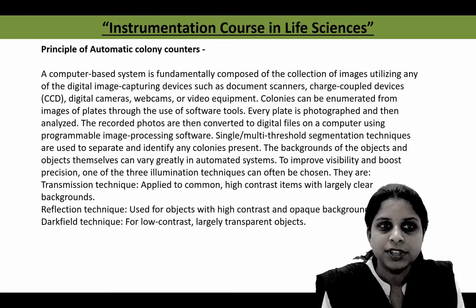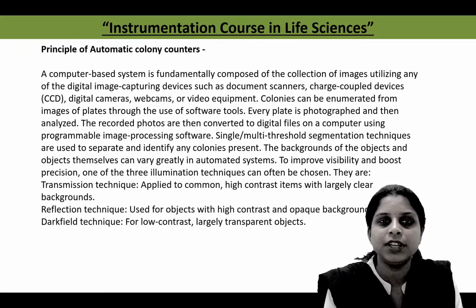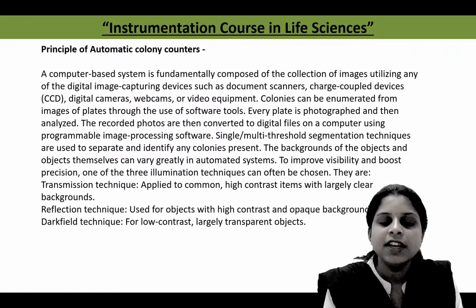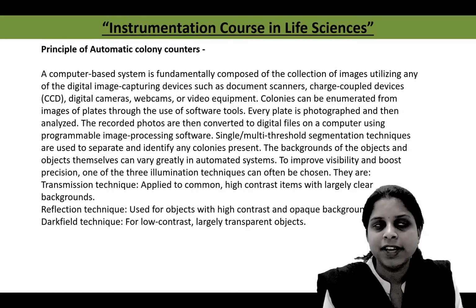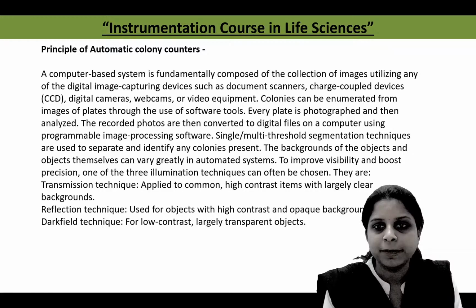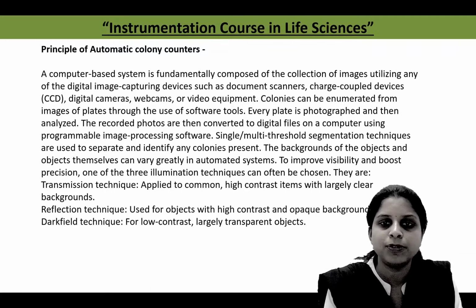Next and very important is the principle of automatic colony counter. How it works, or how it can carry out the measurement of colonies which are present in the Petri plate or in a culture. A computer-based system is fundamentally composed of collection of images utilizing any digital image capturing device such as document scanners, charge coupled device that is CCD, digital cameras, webcams or video equipment. Colonies can be enumerated from an image of plates through the use of software tools.